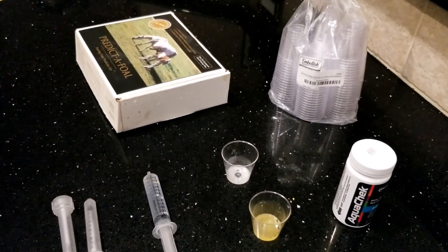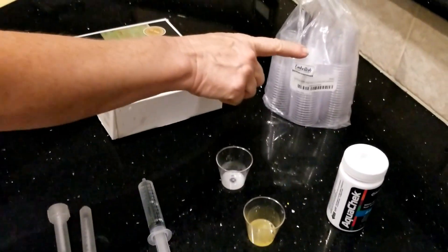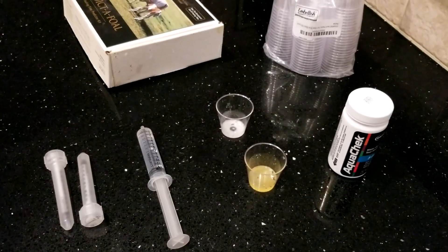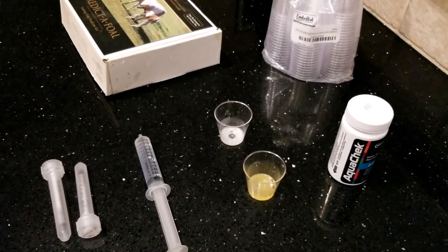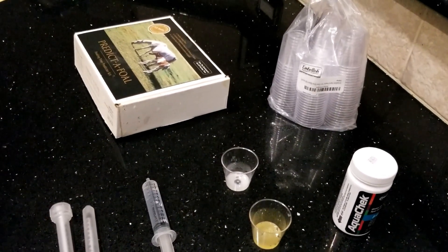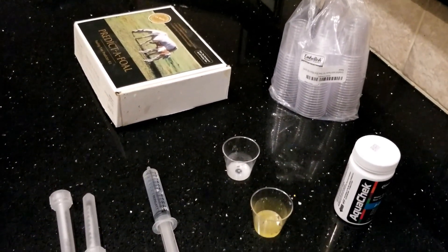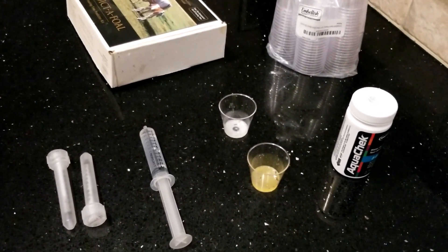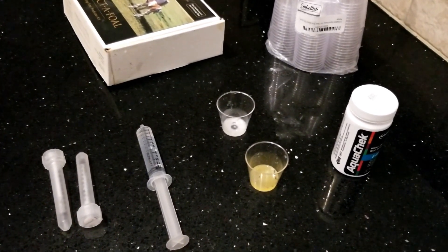Next, you will need a milk collection cup. I like to use the clear 1-ounce plastic shot glasses. I like a disposable cup, as washing with tap water can leave a residue on the collection cup that can affect the next test. If you decide to use a reusable cup, be sure to rinse it out well with distilled water to help remove all tap water.